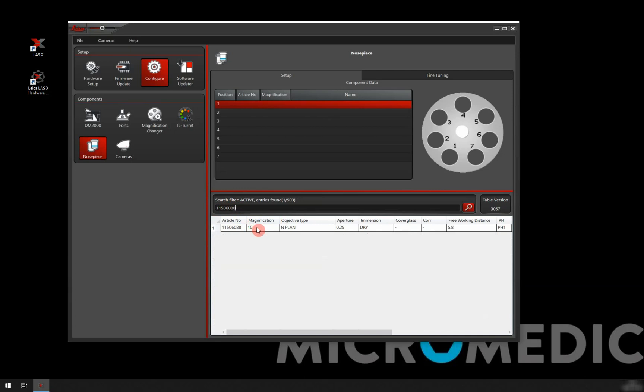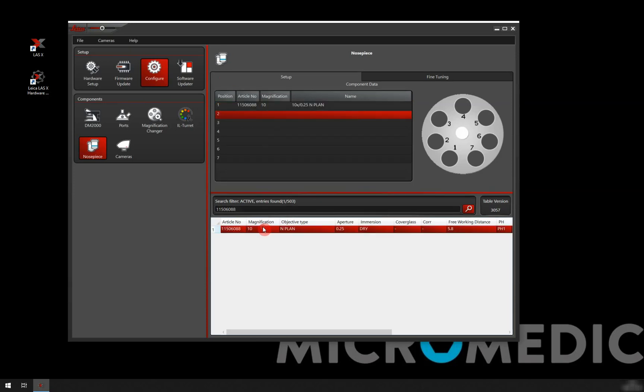So I double click on this. I have this on position one. So I have marked position one and I add that one.